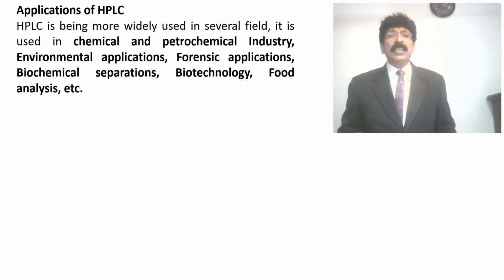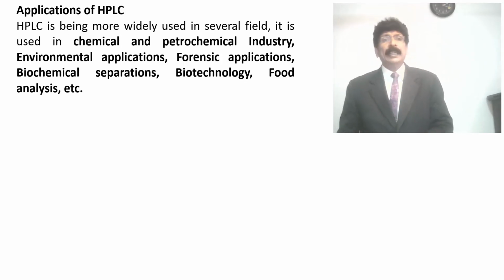Now, application of HPLC. From an examination point of view, I am not giving more examples. The student has to write if it is a 10-mark question. So HPLC is being widely used in several fields.